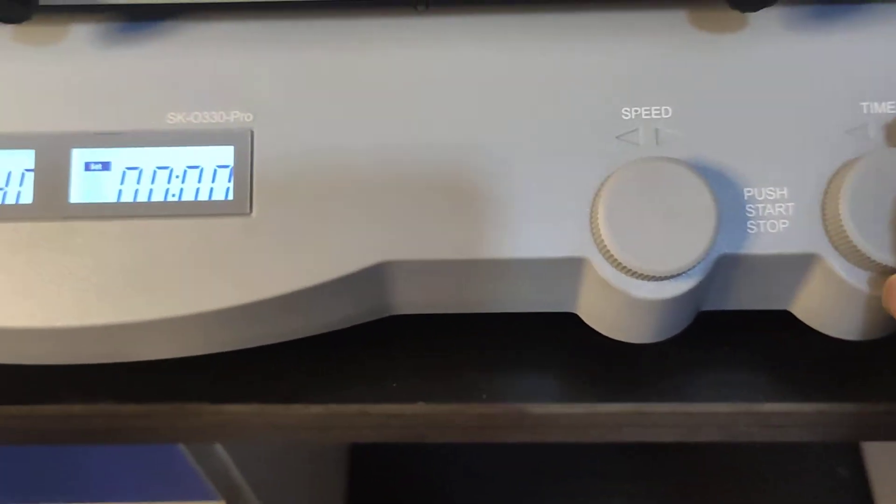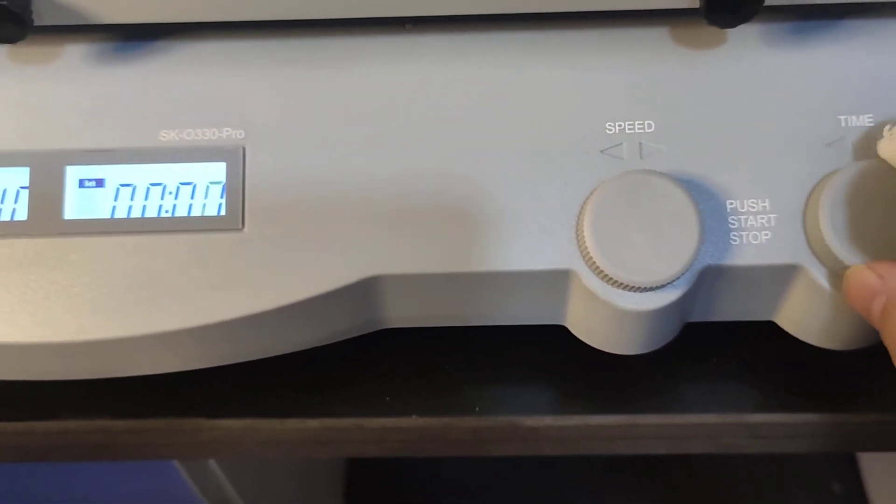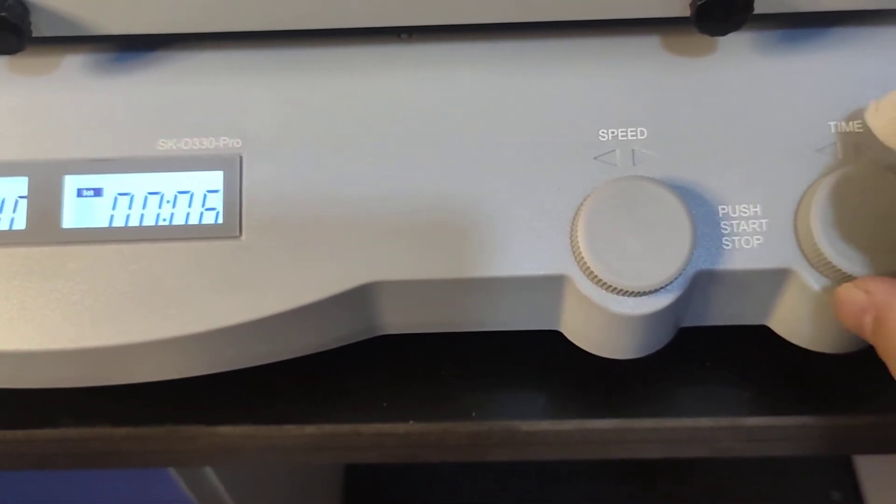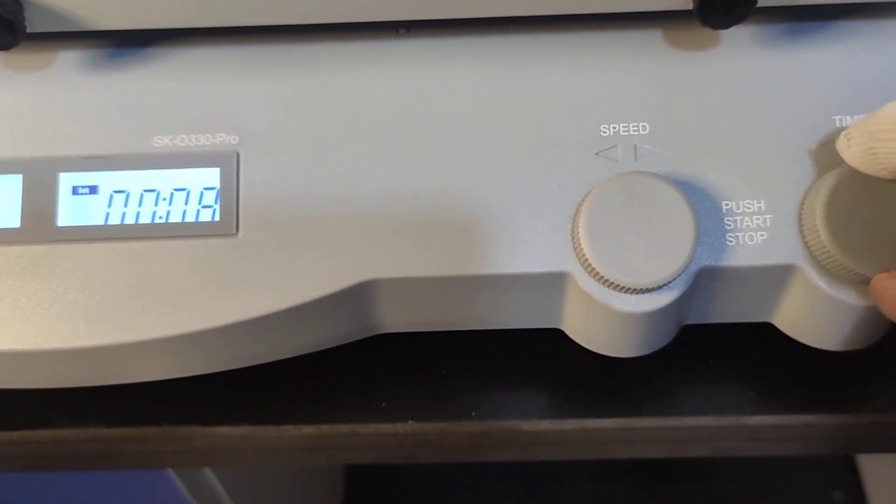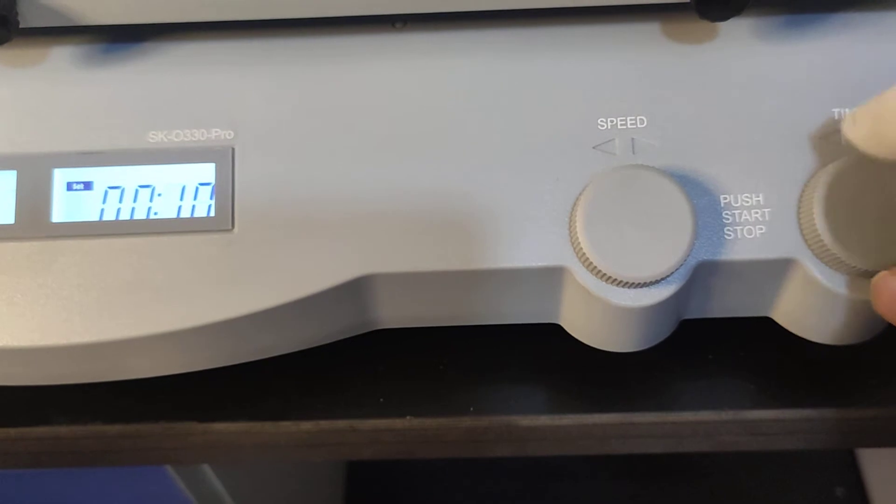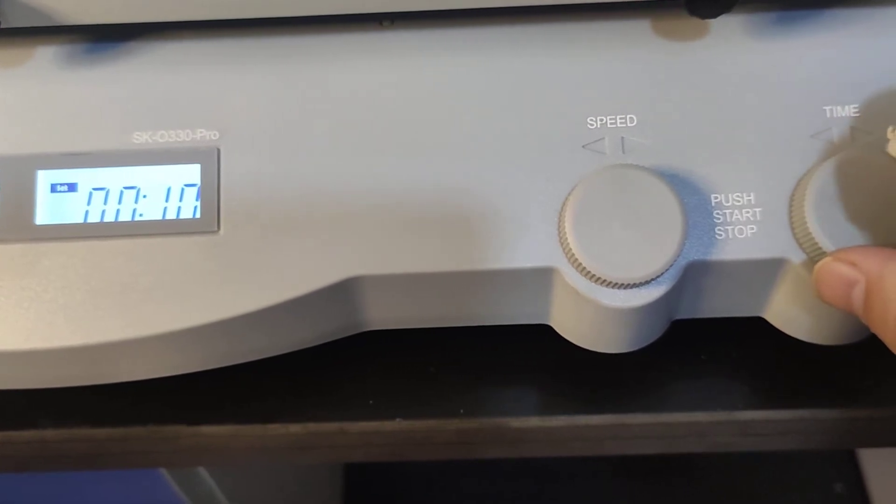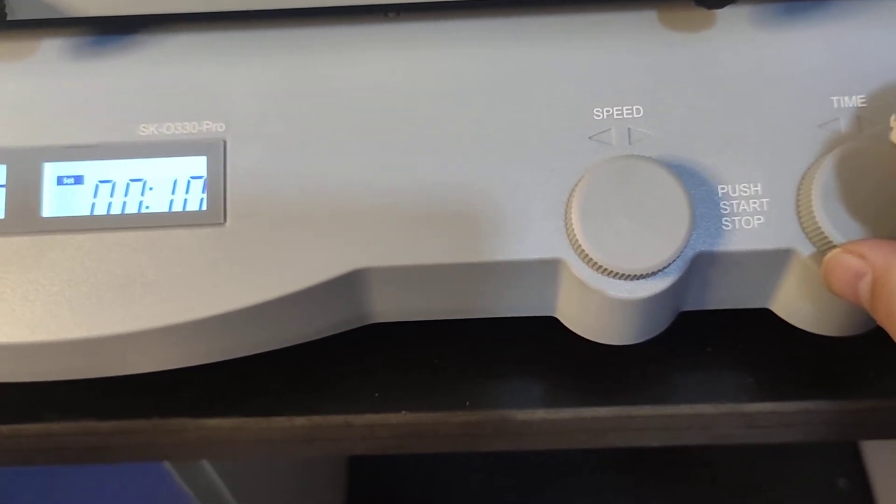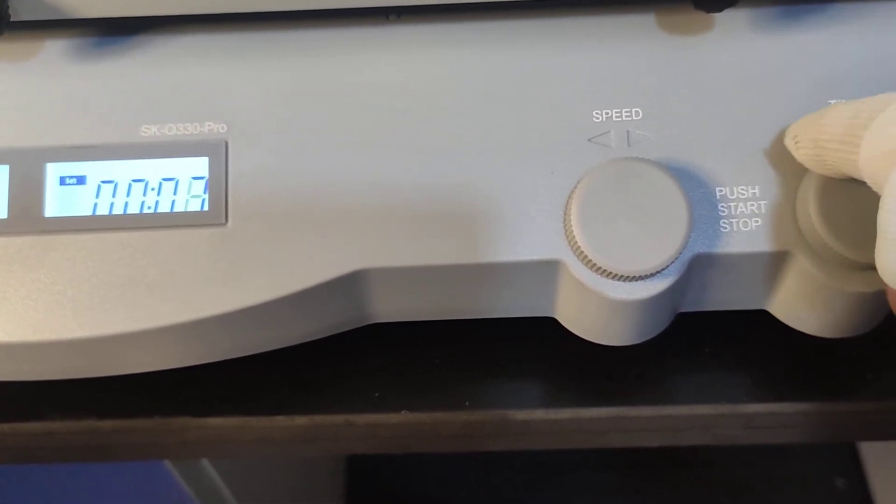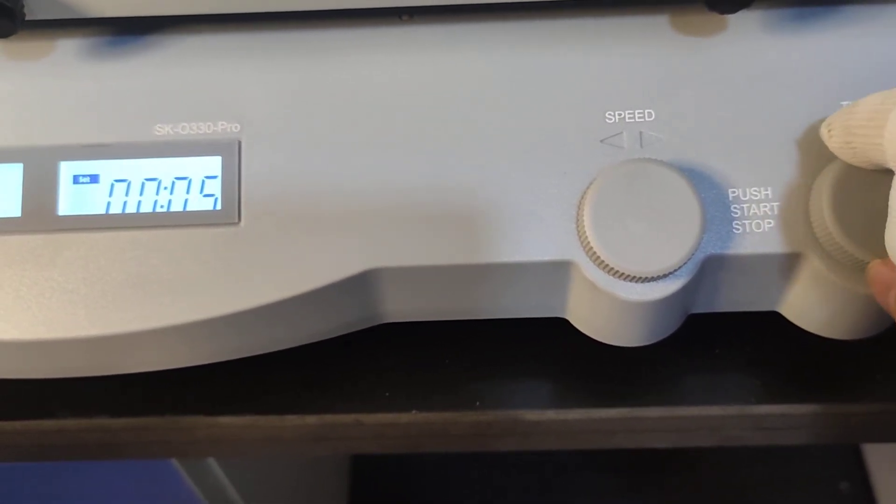And for the timer, it's the same. Twist to the right, time increasing. Twist to the left, time decreasing.